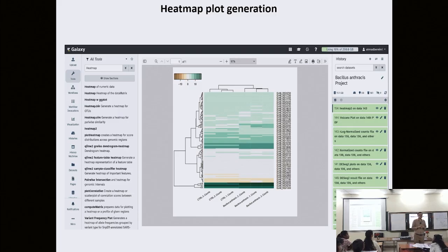But when you make a network and map the differentially expressing genes on the network and identify the modules that are enriched in differentially expressing genes, maybe you have found only 4 modules that have enrichment, and they are representing these pathways. So you would want to perform gene ontology or functional enrichment analysis of those modules to understand which pathways or functions they represent. That way you will come to know that these pathways or functional modules are differentially expressing under that condition.